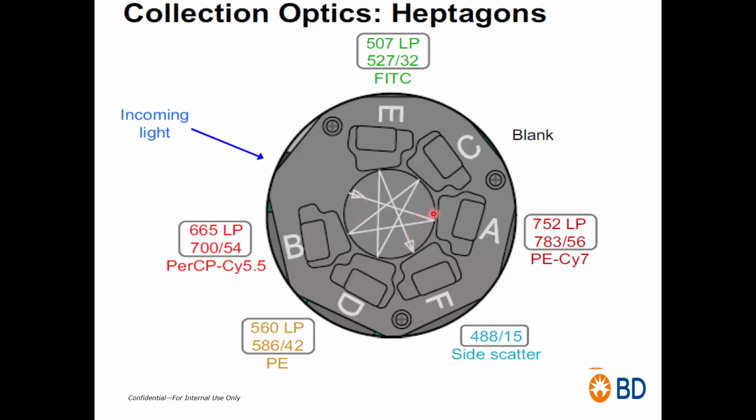And now this is working in reflectance. As you see, first it will come and it will reflect those wavelengths which are lower than this, then those wavelengths which are lower than this. So basically it is working on your reflectance.